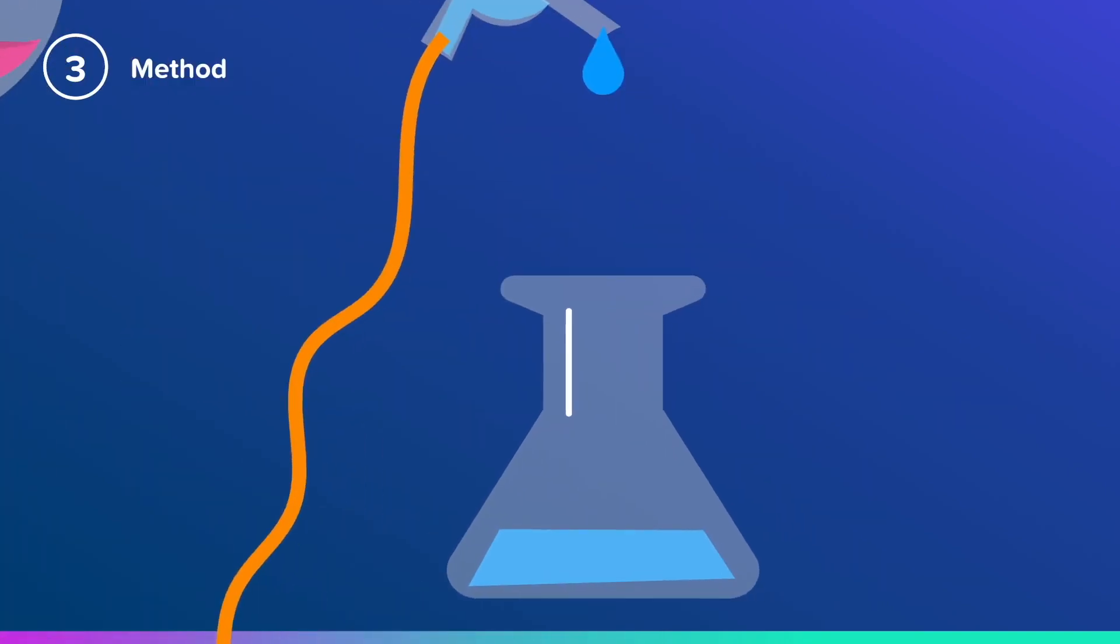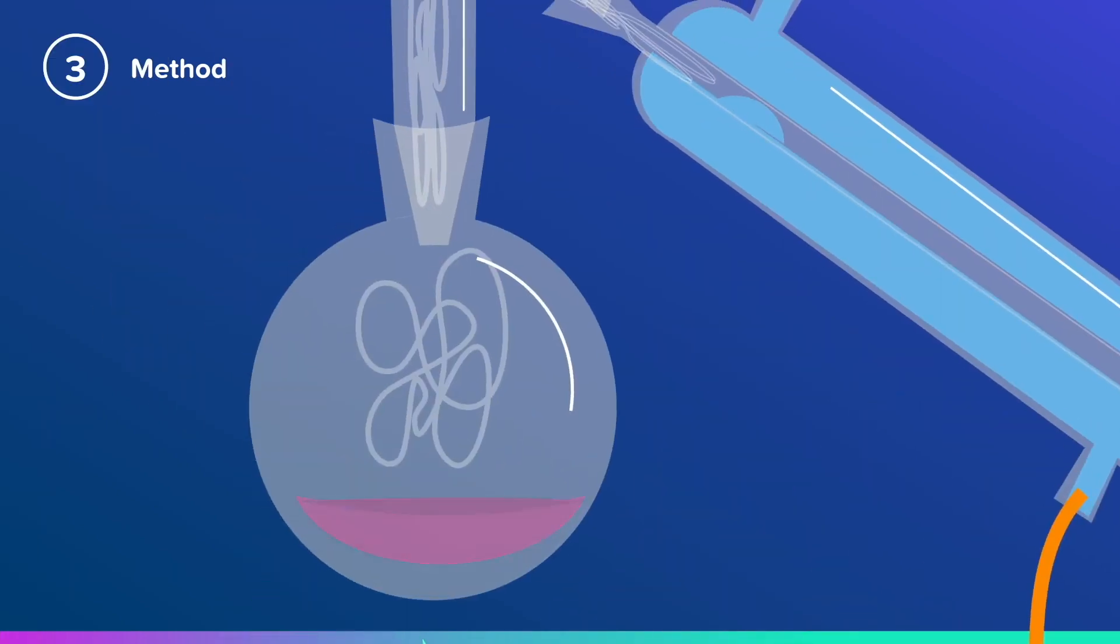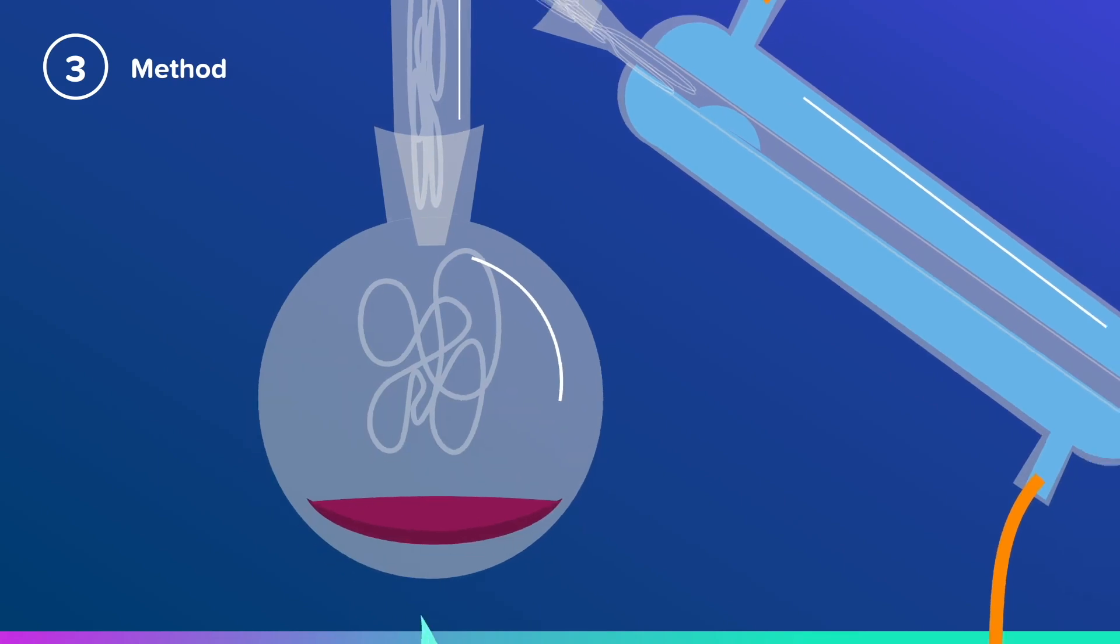Distillation takes a while, and you'll only be adding water a drip at a time, so you must be patient. Eventually, all of the liquid will have evaporated, and you'll be left with a pure concentrated dye in the round-bottomed flask. Once that has happened, switch off your Bunsen burner.